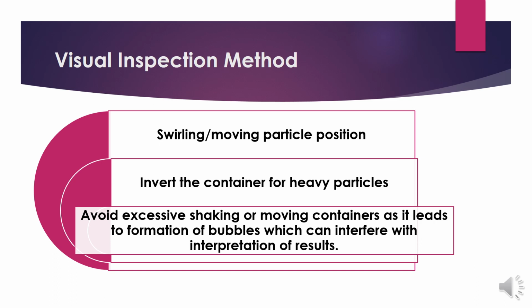In both cases, it is suggested to avoid excessive shaking or moving of containers, as it leads to the formation of bubbles which can interfere with the interpretation of results.